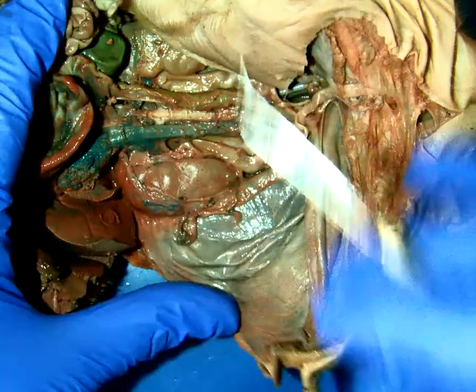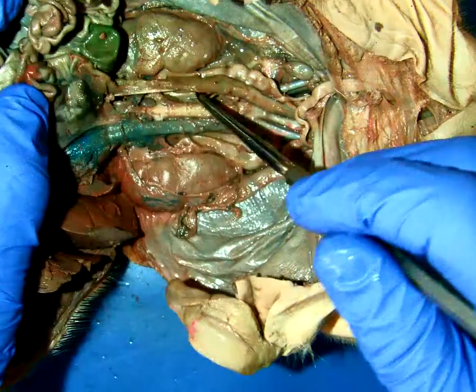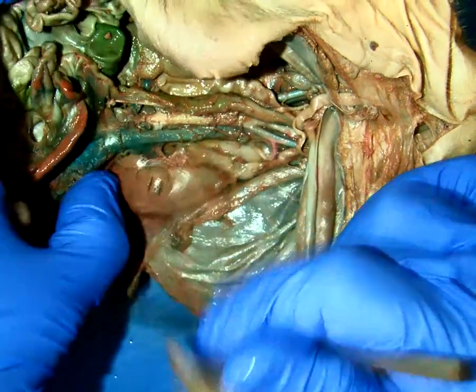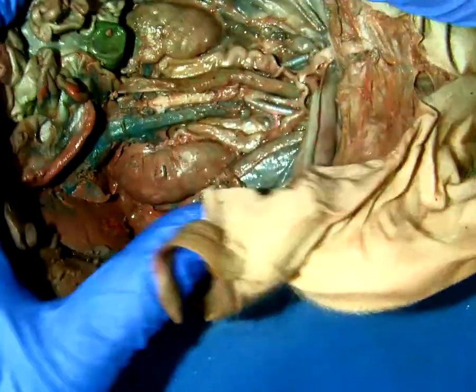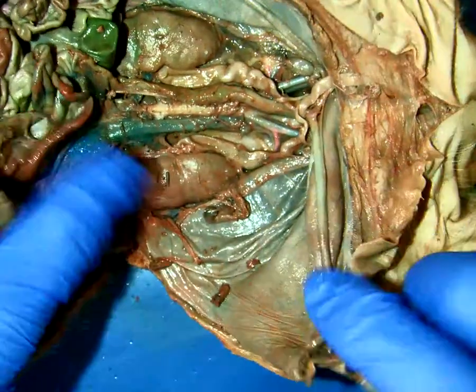So now, if I move aside all the viscera to kind of get it oriented here, and it's a challenge at first, right, to get your bearings. So you always find something that you really know consistently. So we've got some kidneys here that, all right, flap of skin, stay out of the way. All right. Okay. So we're going to kind of keep this out of the way.